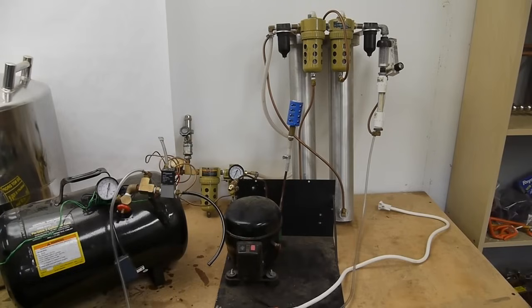So if you tried to make this liquid nitrogen generator by going down to the welding store just getting tanks of nitrogen, you'd end up spending much more for the nitrogen gas. So the purpose of all this is to take air, just plain old atmospheric air, compress it and filter it and dry it so that we have a source of dry nitrogen.